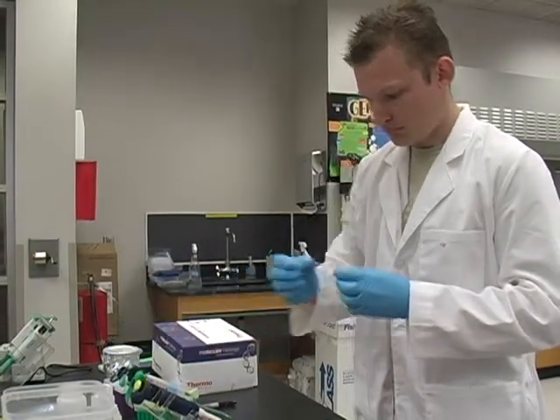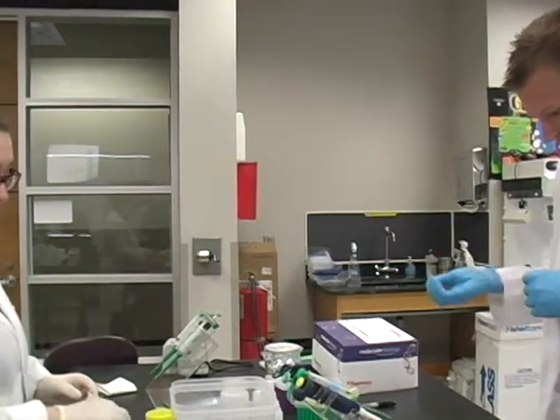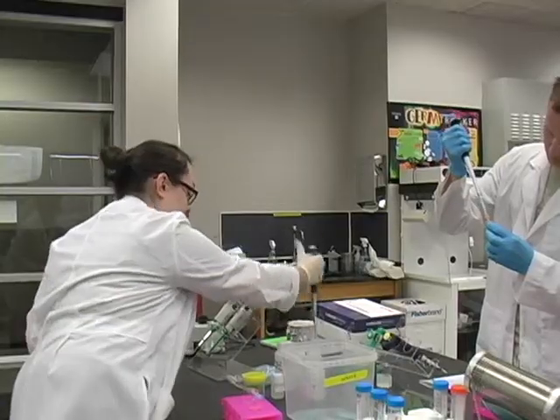The other way to make sure that they have the plasmid DNA would be to quantitate it using an absorbance reading, but we're going to look at it on the agarose gel to make sure it's the correct size and it is the correct plasmid.